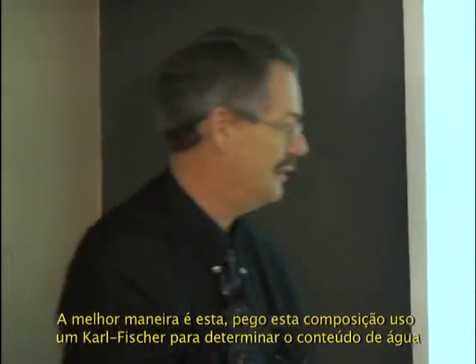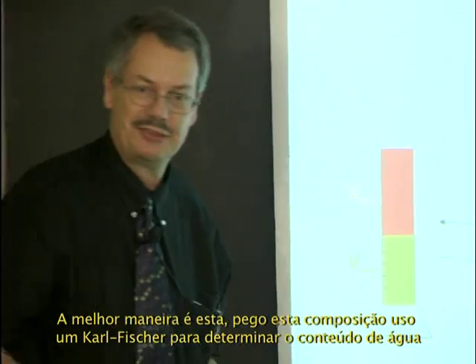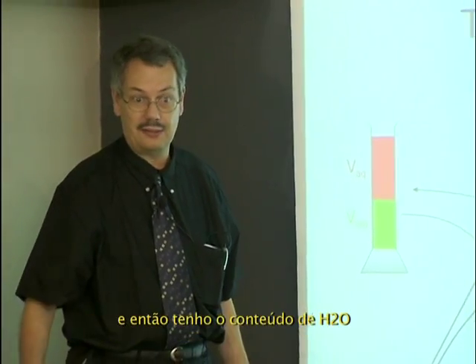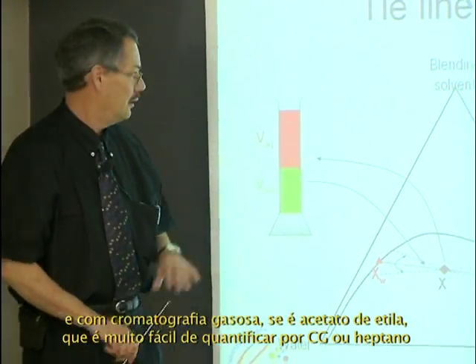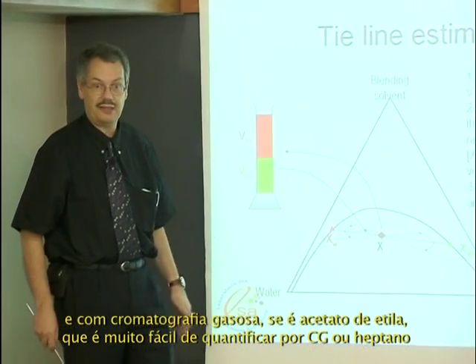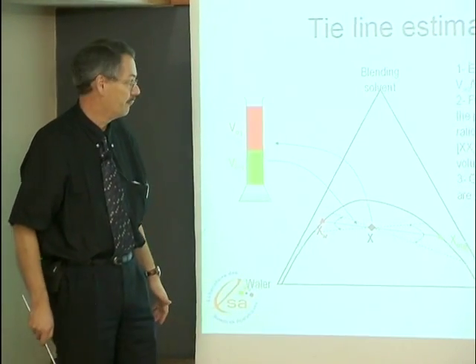The best way is this one. I take this composition, use a Karl Fischer determination of water content, and then I have the water content. And with gas chromatography, if it's ethyl acetate, for example, very easy to quantitate ethyl acetate by gas chromatography, or heptane by gas chromatography.